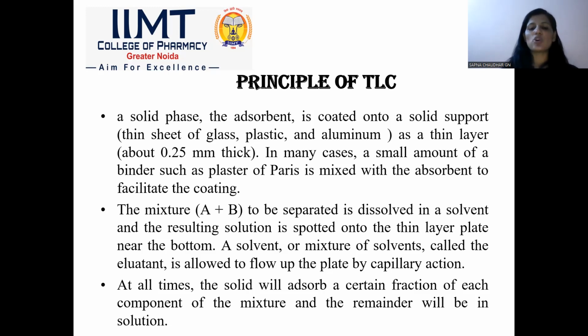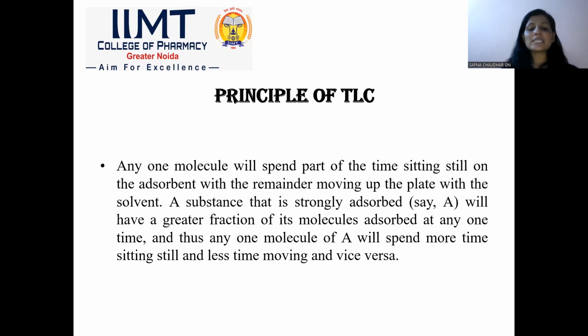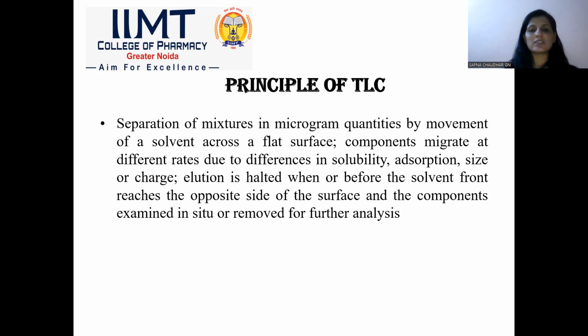At all times, the solid will adsorb a certain fraction of each component of the mixture, and the remainder will be in the solution. Any one molecule will spend part of the time sitting still, adsorbed, and the remainder moving up the plate with the solvent. A substance that is strongly adsorbed, like substance A, will have a greater fraction of its molecules adsorbed at any one time, and thus any one molecule of A will spend more time sitting still and less time moving, and vice versa.